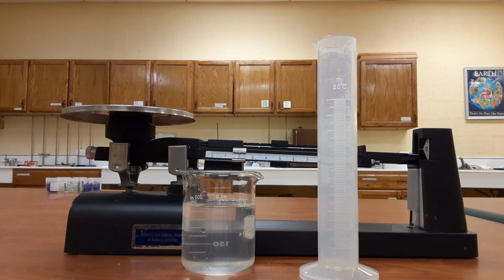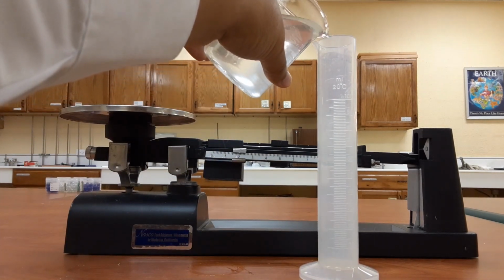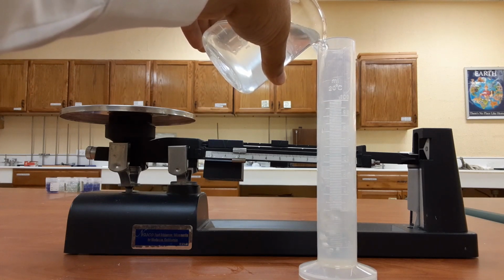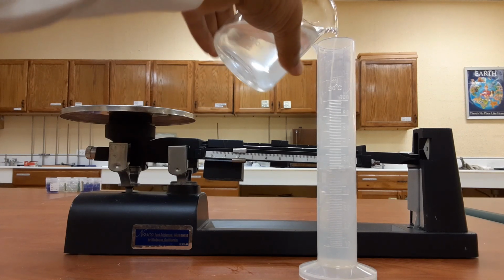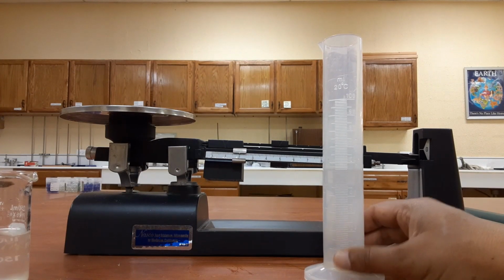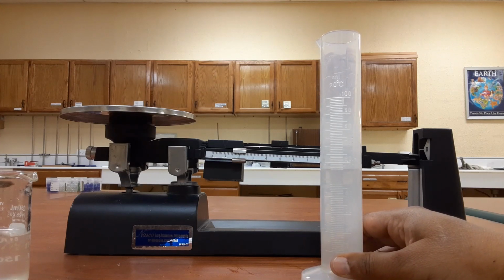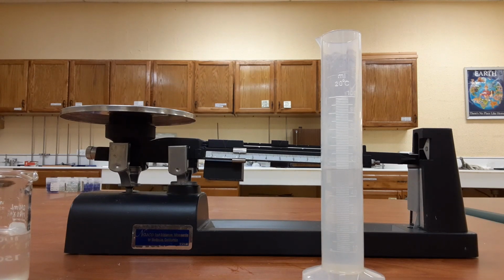Next we take the water and we pour some water into the graduated cylinder. About 50 to 60 centimeter cube or 50 to 60 ml is good. So don't fill it up all the way. So right now the volume of water in the graduated cylinder is 54 centimeter cube. Okay, so we now have the volume of water is 54 centimeter cube.